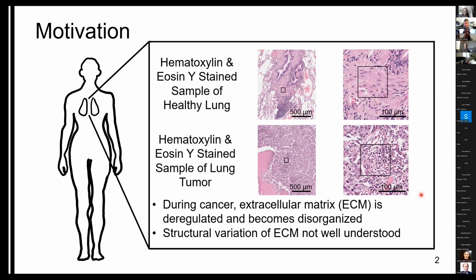So since collagen is a major component of the extracellular matrix, monitoring its structure, which we can do with our technique, allows us to use collagen structure as an indicator of disease status and progression in a variety of different organ tissues. So the biocrystalline structure of collagen allows ultrastructural measurements by second harmonic generation, or SHG, microscopy without even the use of any dyes or stains.